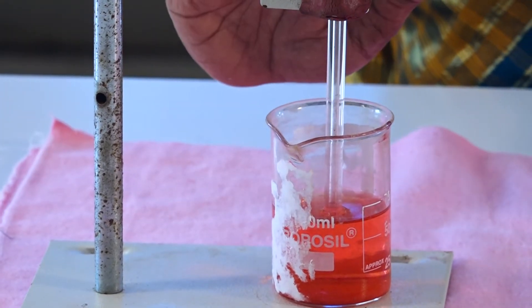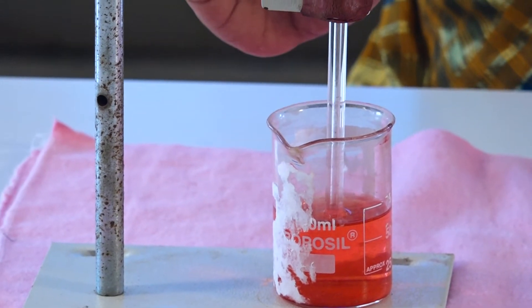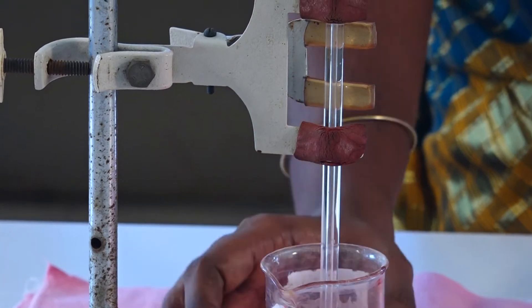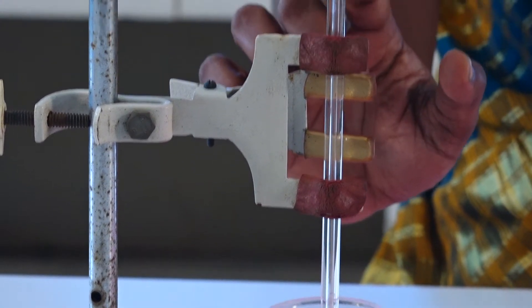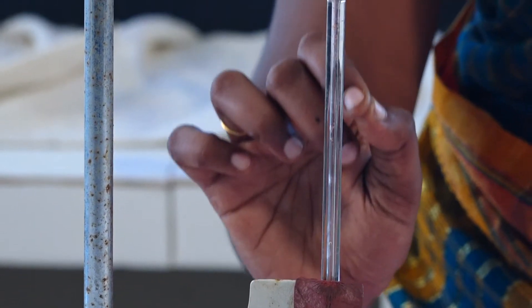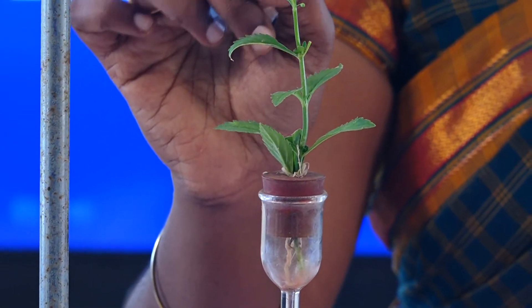After the whole setup is ready, we have to expose this setup to sunlight. After about half an hour, we observe there will be a rise in the water level of the pipette. This tells us that once there is a loss of water in the leaf, water is drawn upward.